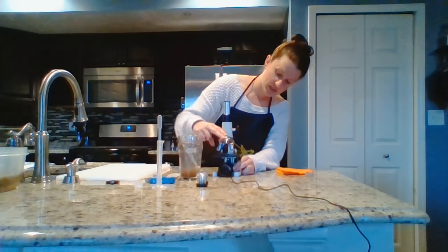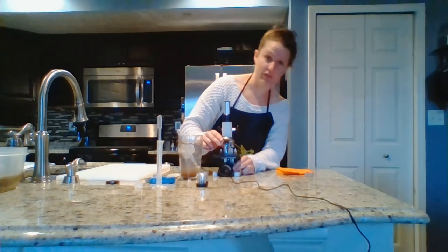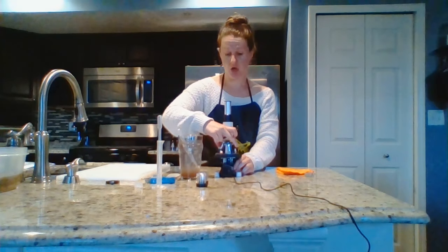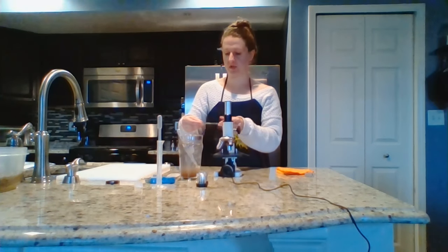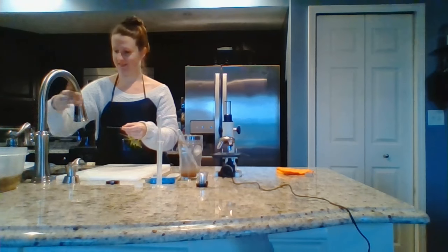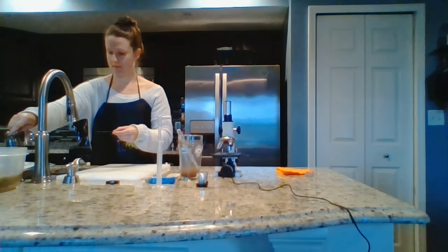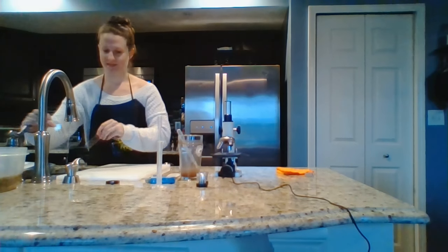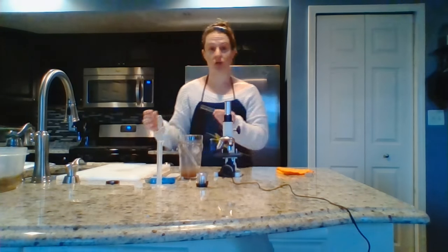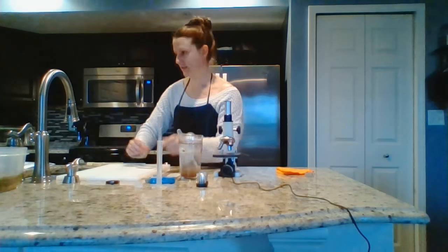If you can still see something, increase it even more. Once you've completed this lab, you can rinse off your slide and cover slip with a little bit of water, then let it dry or dry it with a paper towel.